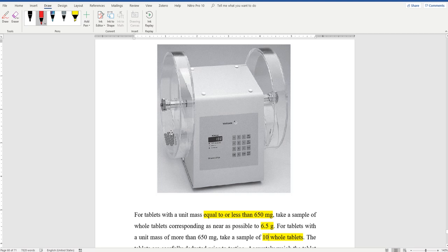If you could not make a judgment whether some tablets or one tablet have some fragments or something like that, or when you weigh the tablets again after the test, after the 100 rounds, you need to remove the tablets and weigh them again.